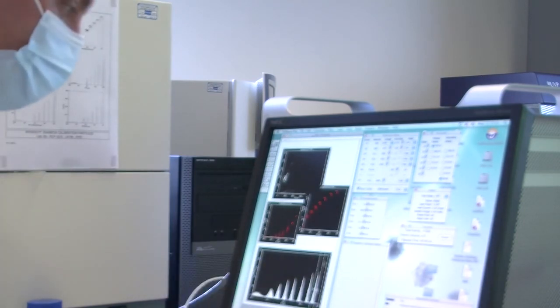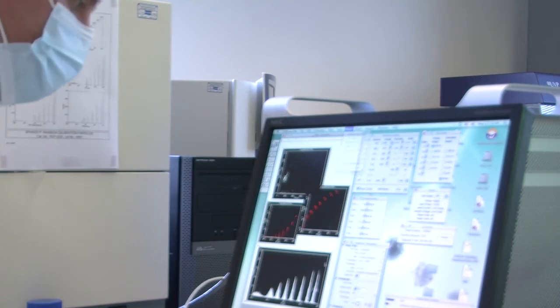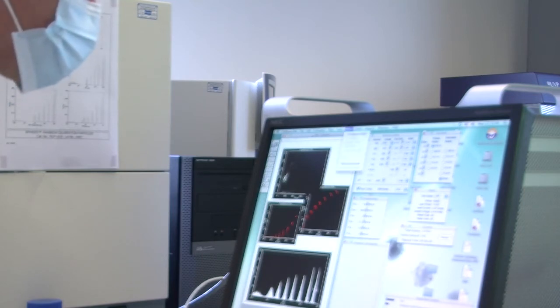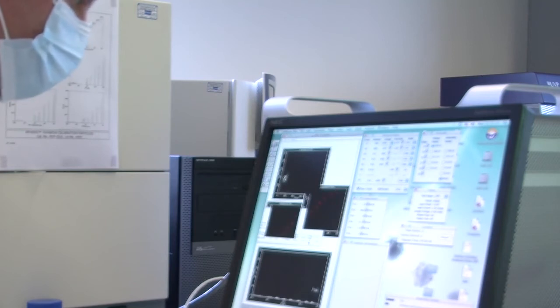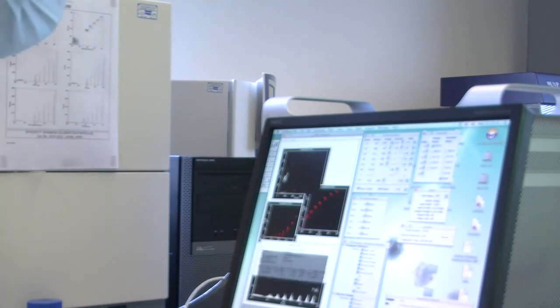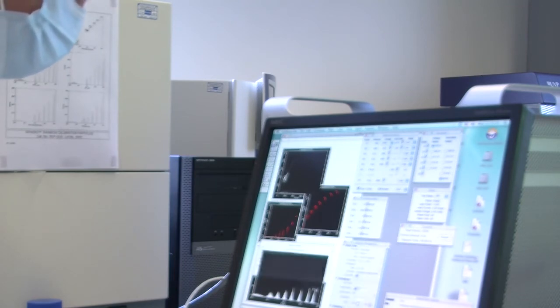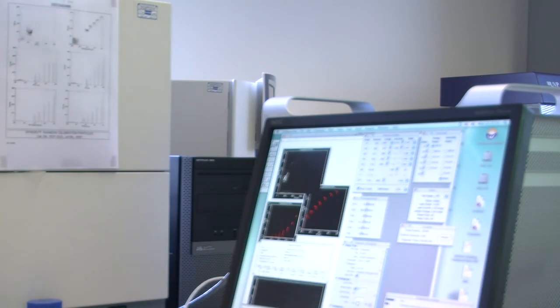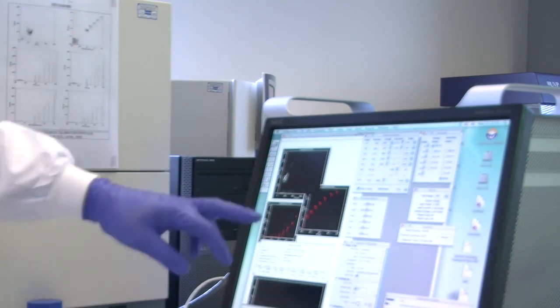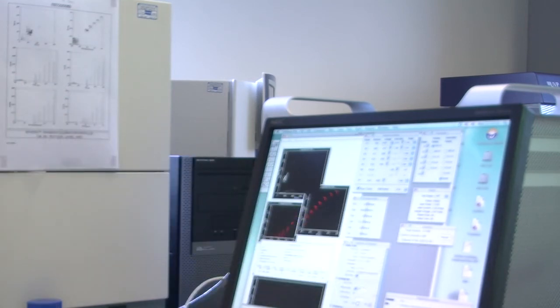And what we can then do is we can show some stats. Unfortunately, you get these weird artifacts. Let me just enlarge that for a moment. So at the moment, we're looking at about 500 events per second. Okay?